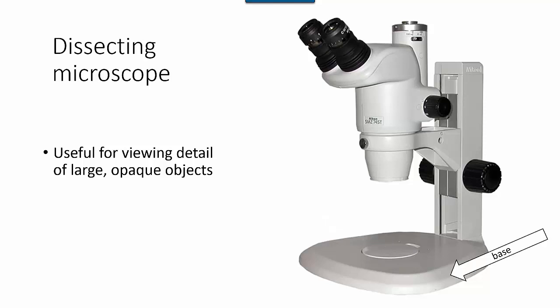On your dissecting scope, there are two options for lighting the stage. To view the surface of an opaque object, you use the incident light. It's adjustable, so you can move it back and forth to adjust the lighting. You can also illuminate translucent objects from below, using the light source underneath the stage. It shines transmitted light through a glass plate on the stage.